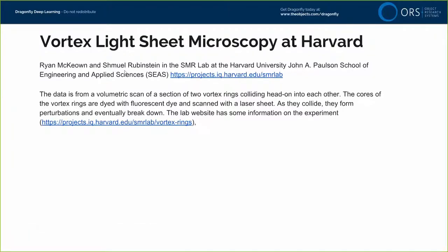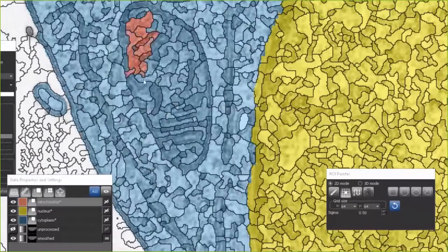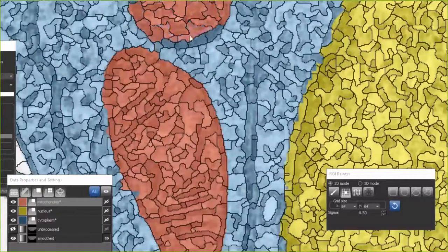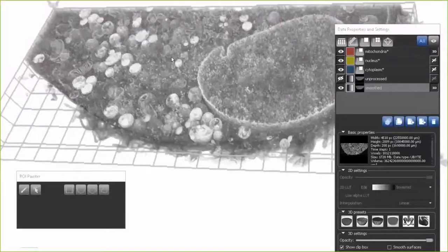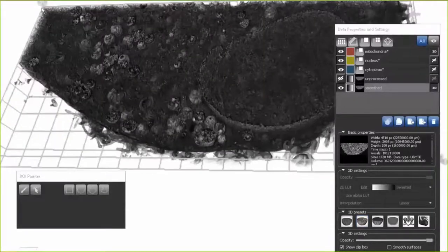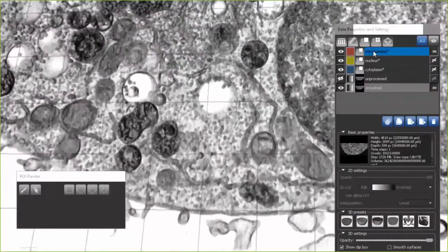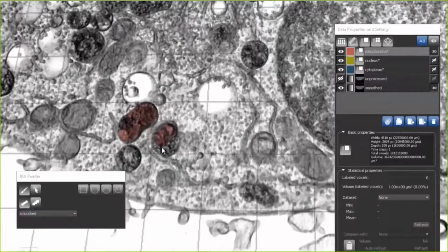This data comes from Ryan McCone and Shmuel Rubenstein at Harvard. Here's another short video discussing our segmentation tools. Most tools in this video are unique to Dragonfly. This shows segmenting data based on superpixel segmentation — a user paints parts of a cell by painting clusters of pixels based on superpixel gridding, which we call Smart Grid. This is used for manual painting of a HeLa cell captured by FIB-SEM electron microscopy. Using a 3D paintbrush or superpixel painting speeds you up significantly.